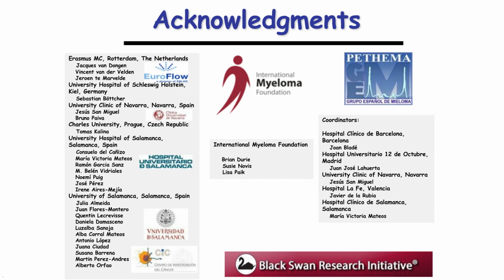We have indeed evaluated the effect of hemodilution, both with in silico generated material and with actual dilution with peripheral blood. There are also some other groups that have been evaluating this. All the information points in the same direction. Those populations that are highly linked to bone marrow samples and absent in peripheral blood are the best indicators of the quality of the samples or the degree of hemodilution. The problem is that this is certainly true and beyond any questioning for untreated samples.